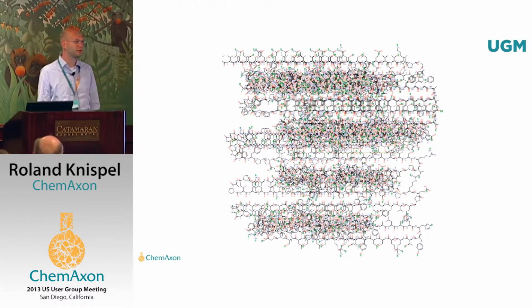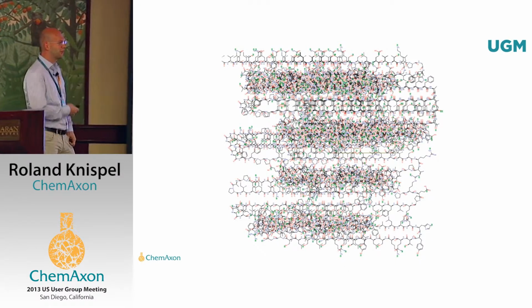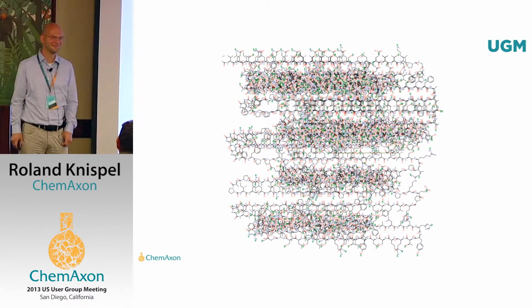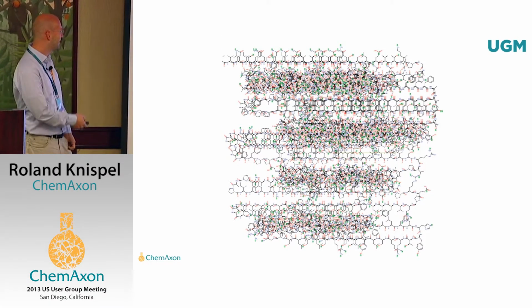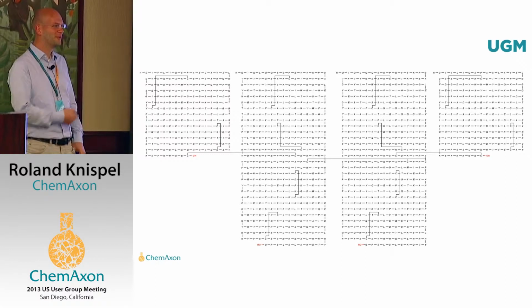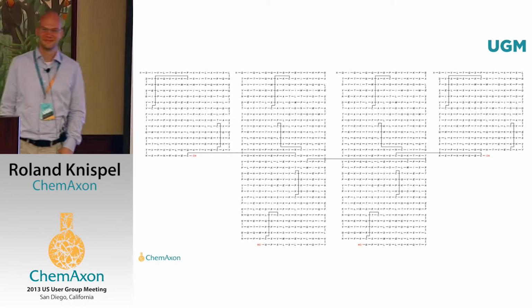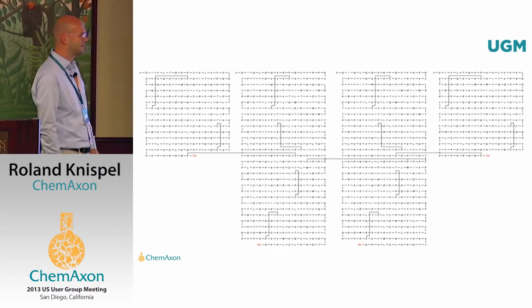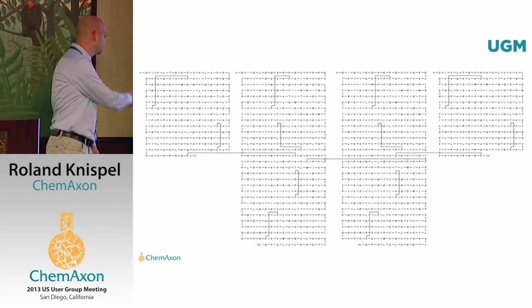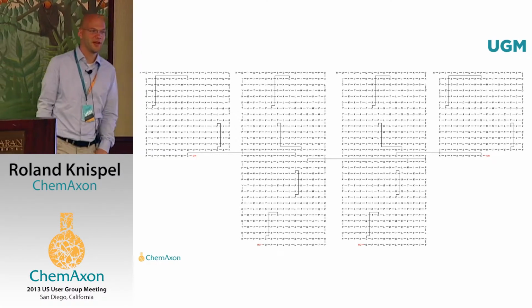A question for every one of you. Do you want to give it a shot and guess what that is? I can help you, but does it look more familiar to you now? I can tell you, it's an IgG molecule, and it contains all of the disulfide bridging patterns.